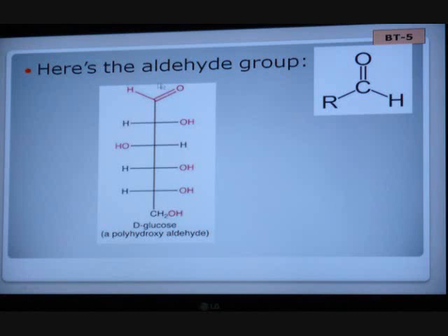Those are findable. And when you add that sucrase to that solution, it should turn colors, green, because you have then split the sucrose into the monosaccharides that do have that ending. But as long as sucrose is together as two, as a disaccharide, that test would be blue to start with. As it bathes, it'll stay blue too. And if it stays blue, that means there was nothing there it found. It didn't find this. All right?